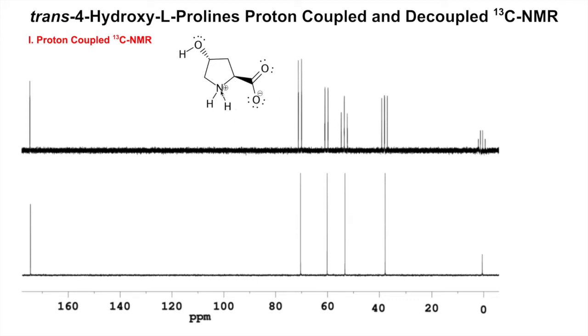So here we have it. It's overall no charge to it, but it has a plus charge and a minus charge. These are given the term Zwitter ions. You probably hear about that when you take biochem or something, but no need to worry too much about it now. Okay, so let's look at our signals.